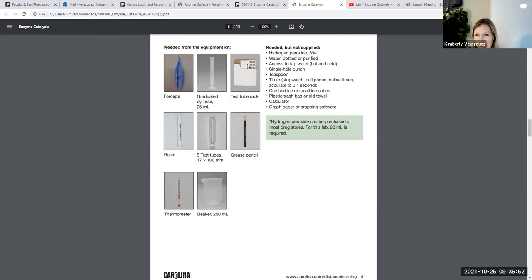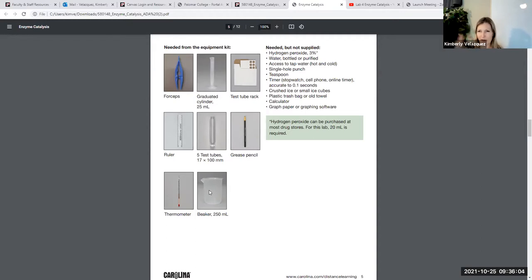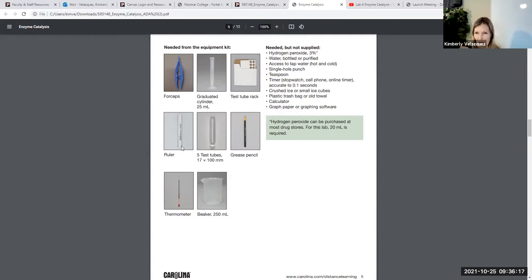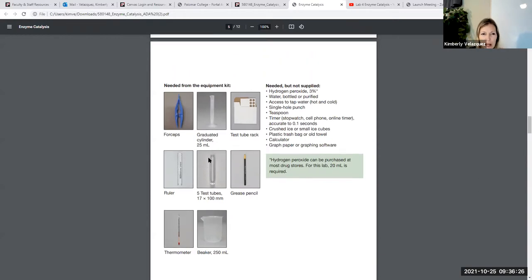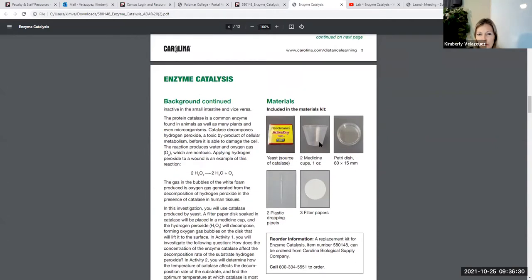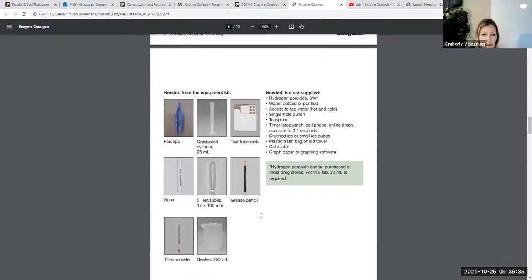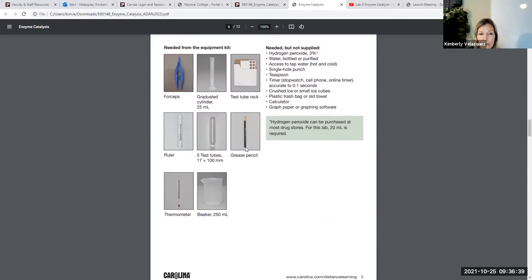From the general equipment bag you'll need plastic forceps or tweezers, a 25 mL graduated cylinder, the test tube rack — unless yours is wrecked, in which case you can sit test tubes inside a beaker. You'll also need five test tubes, a grease pencil (or wax pencil), a thermometer, and your 250 mL beaker. Additionally, we provided a small bottle of hydrogen peroxide in a brown bottle in your lab kit box.